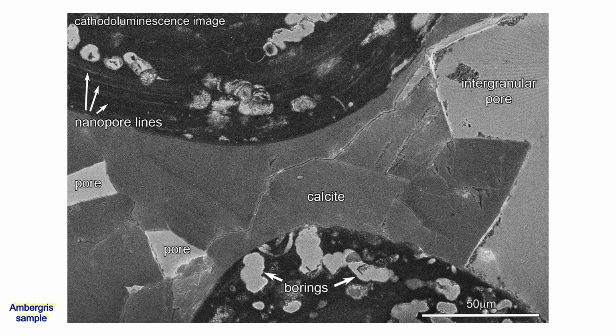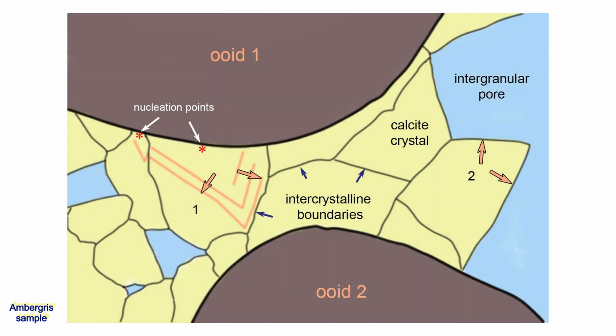The growth of these calcite cement crystals is now discussed using a simplified sketch. The 2 calcite crystals that nucleated on ooid 1's surface left faint internal rhombic zones during their early growth, but later, and all other crystals, are unzoned.